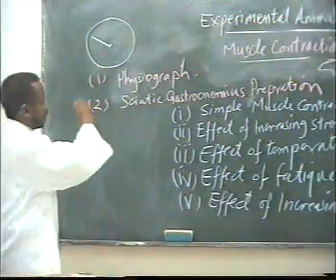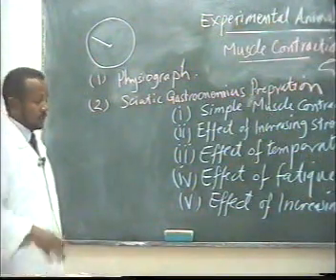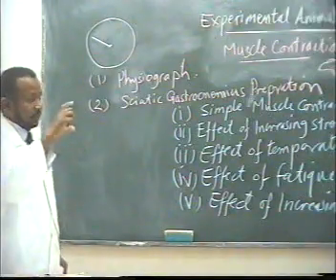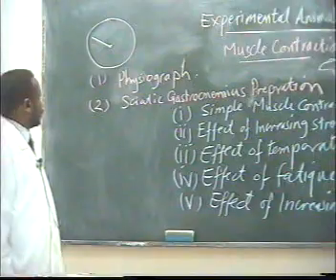So the deflection depends on the electrical signal, which in turn depends on the mechanical contraction as a result of muscle shortening.